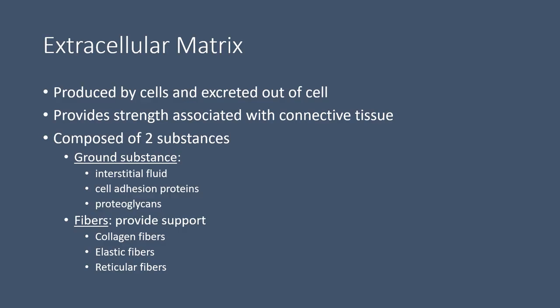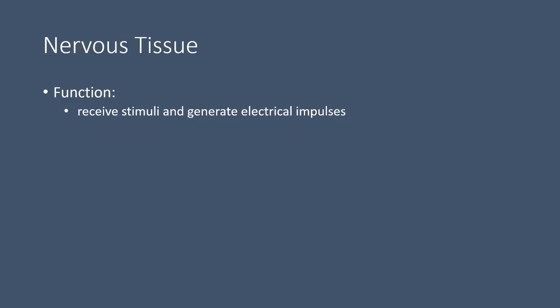Fibers help to provide the support. It could be collagen fibers, elastic fibers, or reticular fibers. So you're going to look at that matrix to help you determine specifically what type of connective tissue it is.